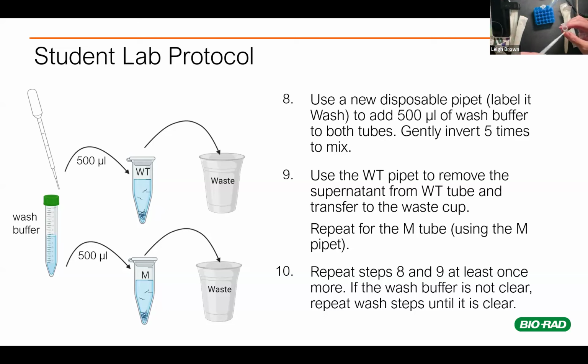So right there, we're at about the 2-minute point. And so you can remove the excess buffer if you would like at this point, so that you've just got the pellet down in the bottom.